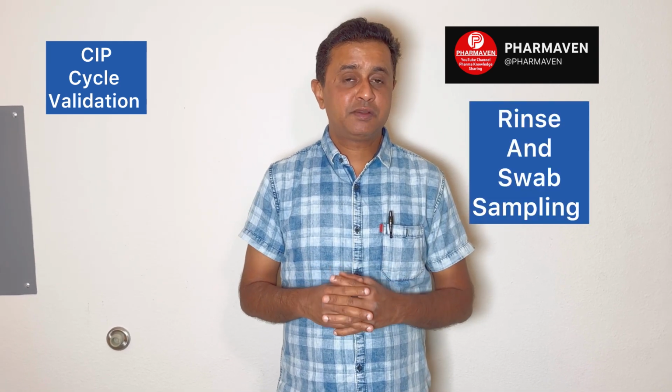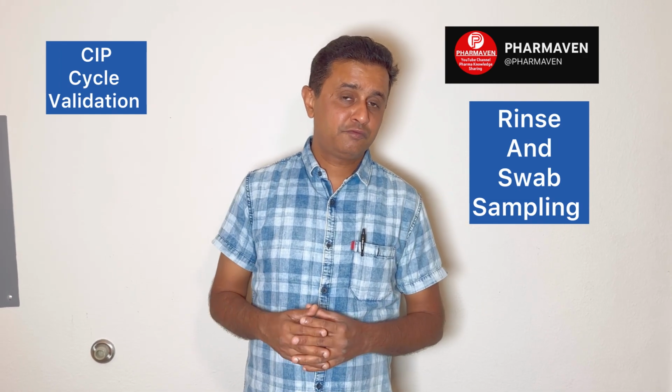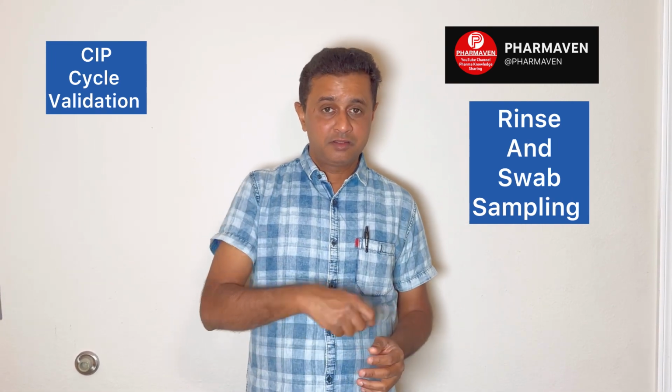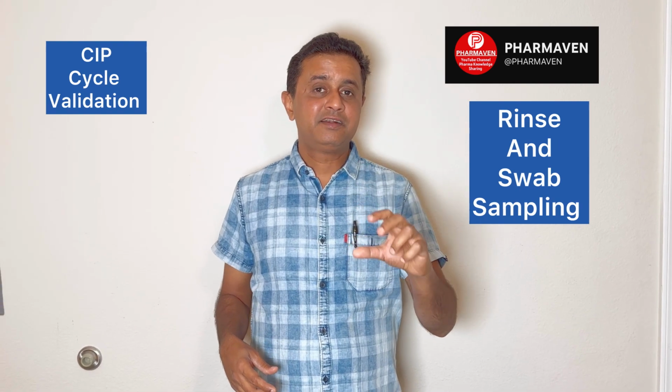Sampling will be rinse sampling and swab sampling. So what is the difference? Rinse sampling means once you have completed the cycle, you take a certain amount of water for injection, or the water which is used for the cleaning, do a rinse, collect a sample and test it for the presence of the product.